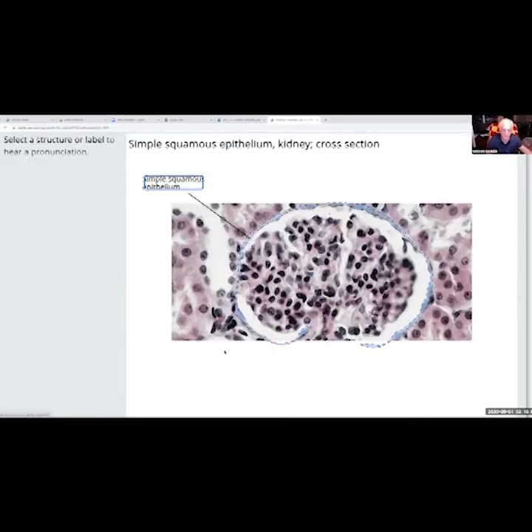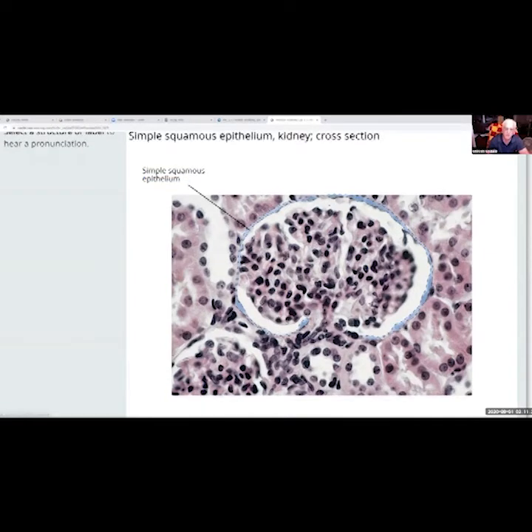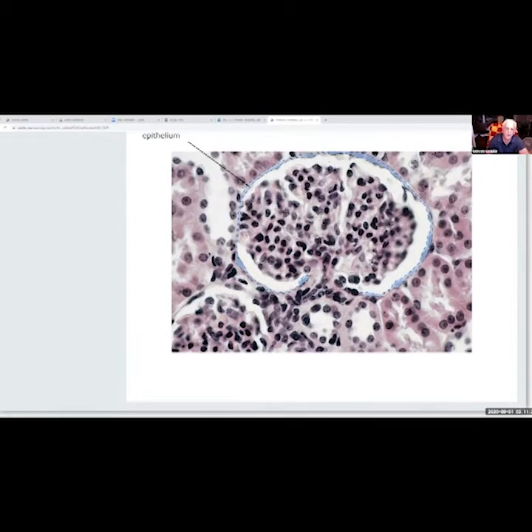Again, this is an enlarged view. Now look around the edge. See where my mouse is going around the edges here? See where the blue circle is? Okay, I'm going to take the blue circle away, and look where that is. There was a nucleus around here somewhere. I'll get rid of the blue circle.